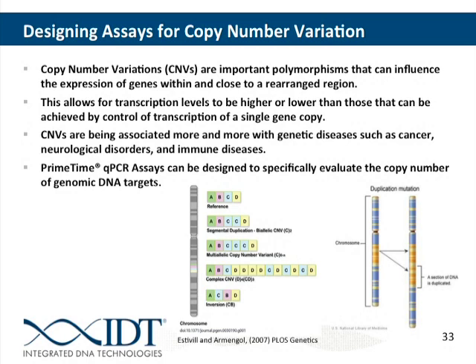So we have just segments of the chromosome where a section of DNA is duplicated. And this can happen in a multitude of ways, either by duplication of just one little segment once, or duplication multiple times, or duplication of one region followed by a larger region multiple times. So CNVs kind of encompass a lot of different genomic duplications. And so we can assess these differences by using CNV assays.